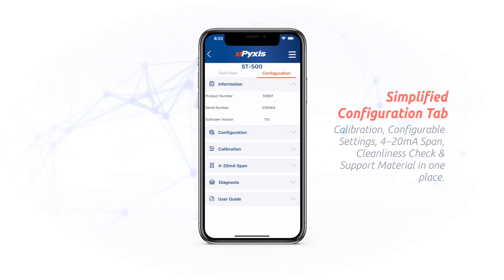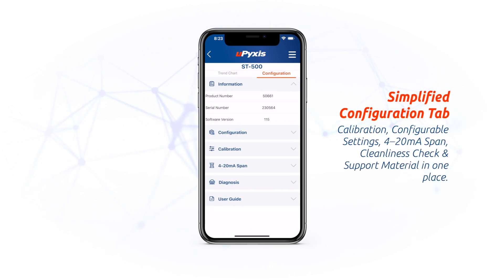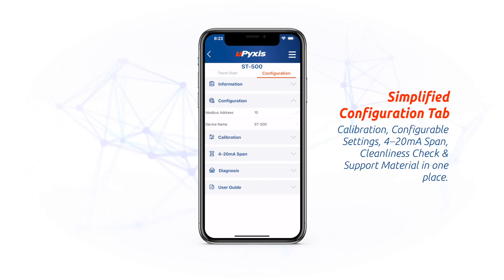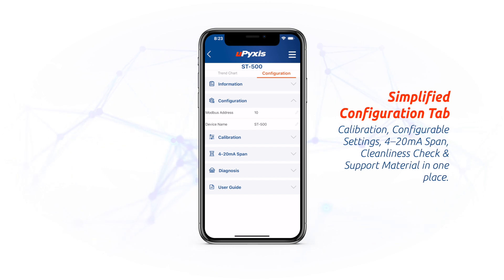The configuration tab is a little different. Simply swipe to the right or click Configuration to head over to an all-in-one area. Here you can find the information in the sensor, configure the sensor, calibrate the sensor, and check the diagnostics.